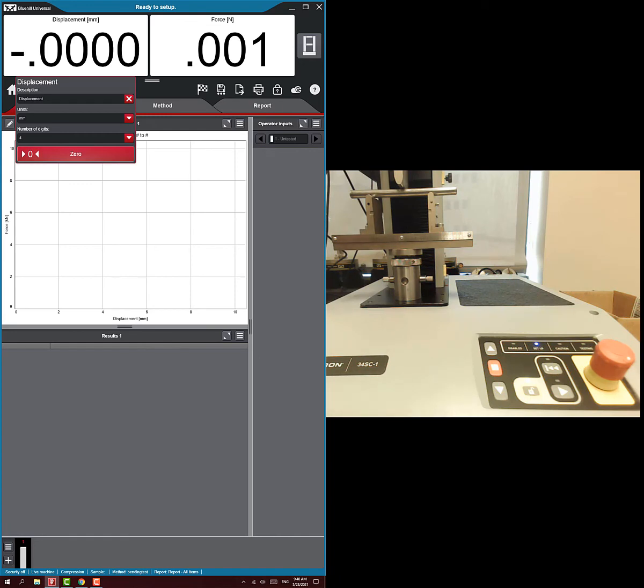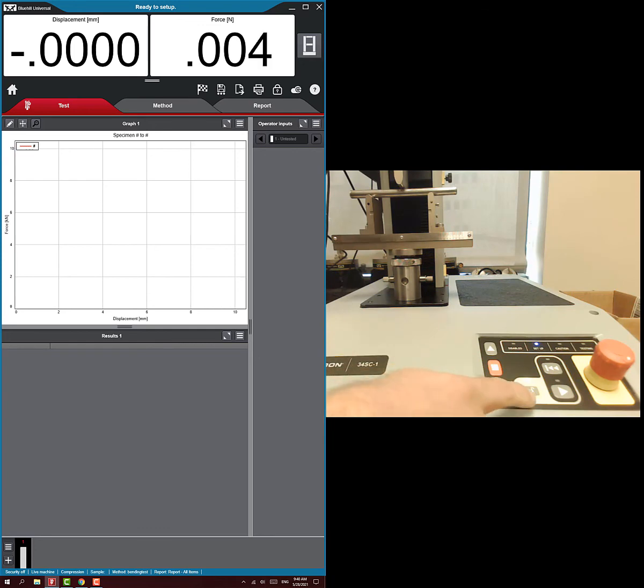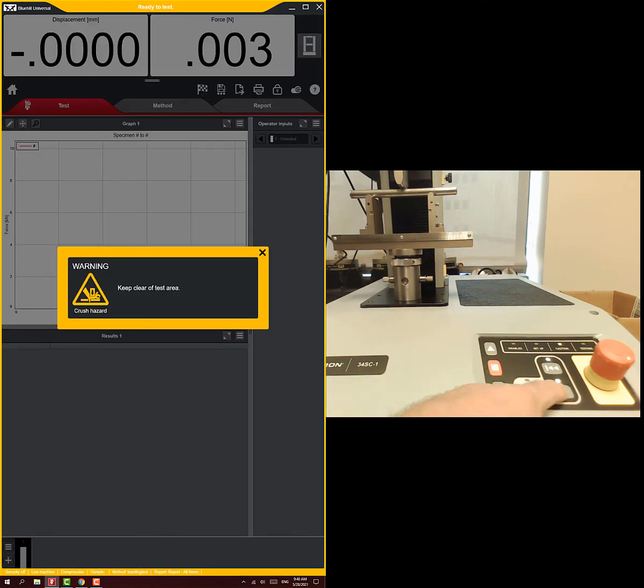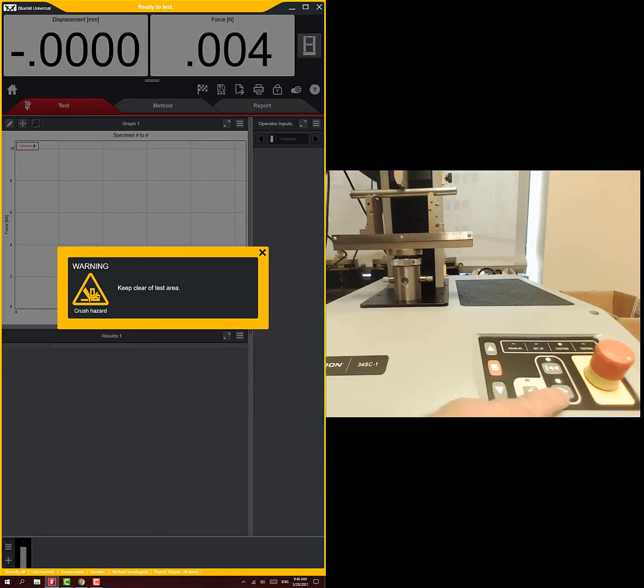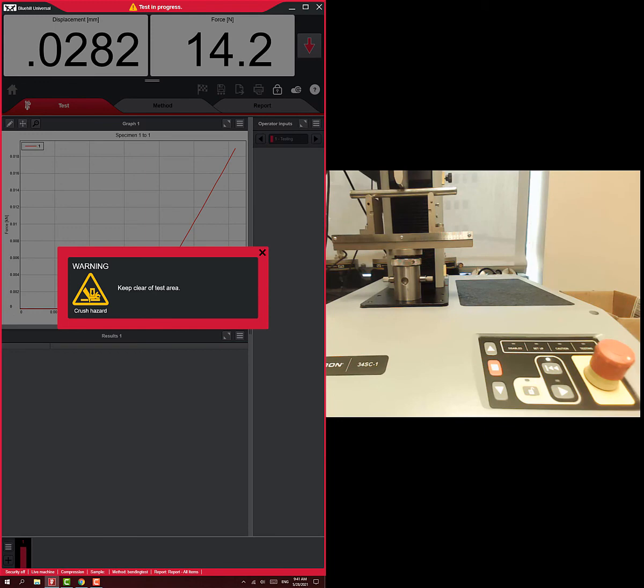Now we're ready to run the test. Force and displacement are zeroed. To run it, first hit the unlock button on the machine, then within a couple of seconds hit the play button. Hit unlock — it says caution and waits — then hit play and it will start testing. You need to be deliberate about this sequence.